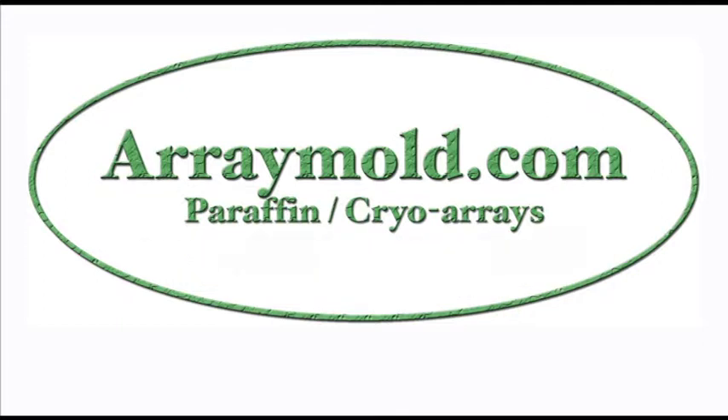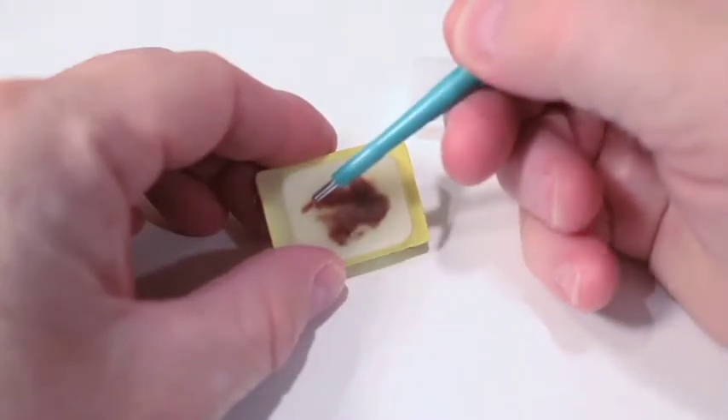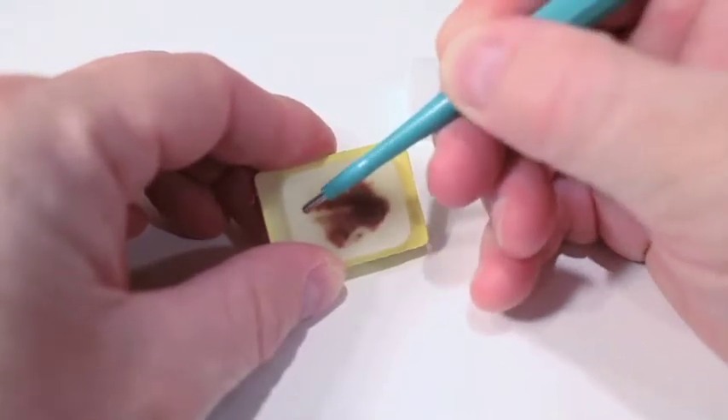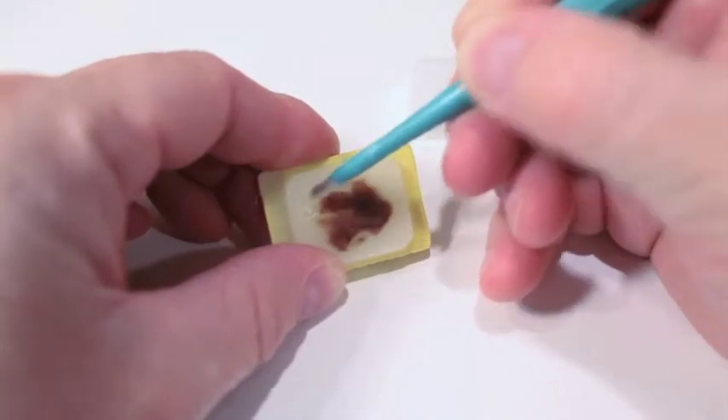The first technique we will cover is called the scraping technique. This is an excellent technique for very shallow tissue blocks. Instead of doing multiple punches to fill your needle, we recommend scraping the tissue out of the donor block to fill the needle. This will make more sense in a moment.